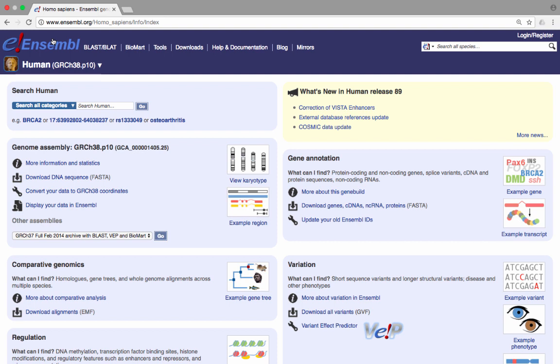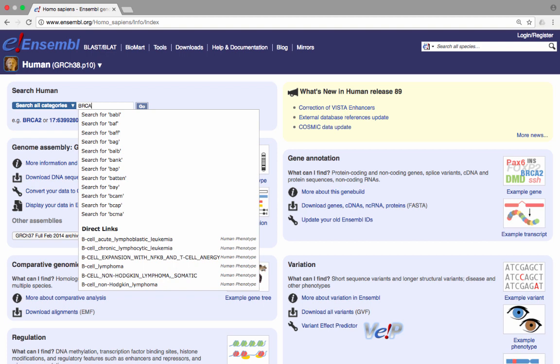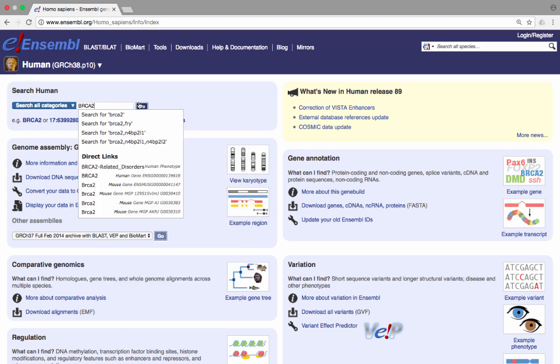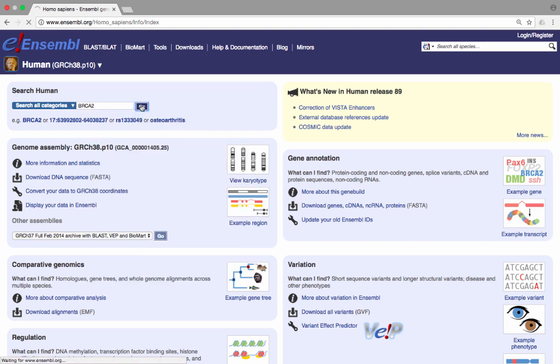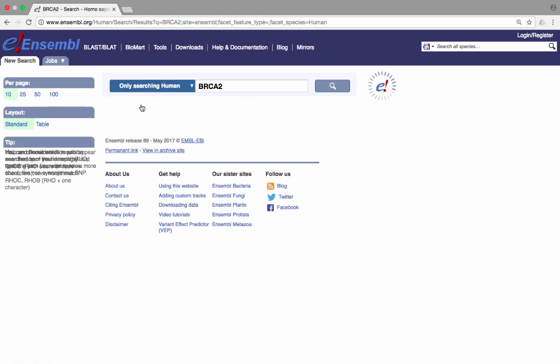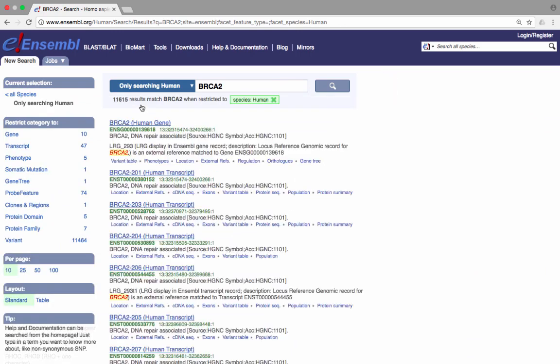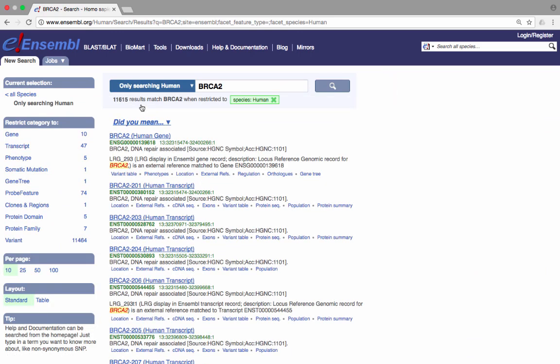Now we will search for a gene of interest by typing BRCA2 in the search bar at the top of the page, and clicking Go. Click on this first link to go to the gene summary page for BRCA2.